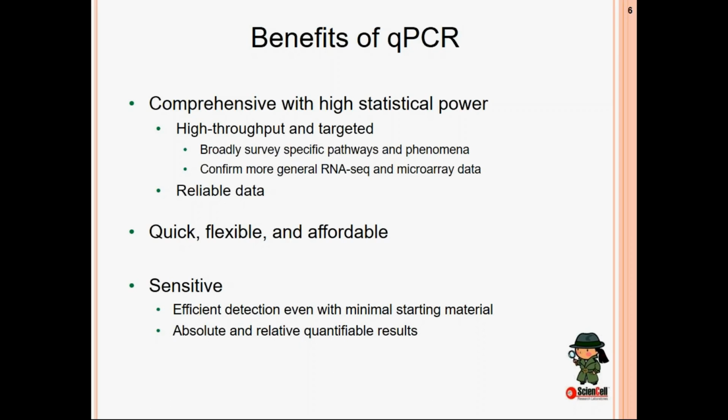or diseases. It is true that other methods like RNA-seq and microarrays survey the entire transcriptome, which would include all of those things. But because of this, those methods sacrifice statistical power and can therefore yield ambiguous results that are difficult to interpret. With the less targeted, high-throughput methods, one can easily miss subtle but important changes in gene expression. Because of these setbacks, qPCR is frequently used to confirm exploratory high-throughput results anyway.